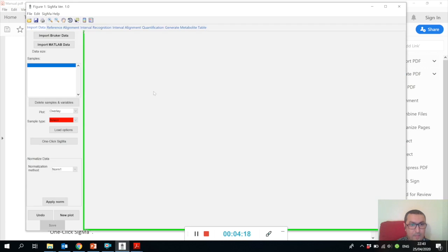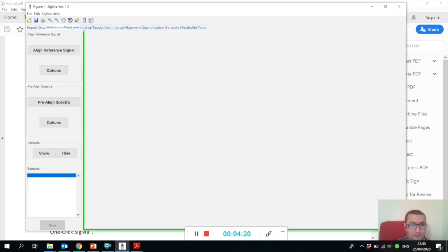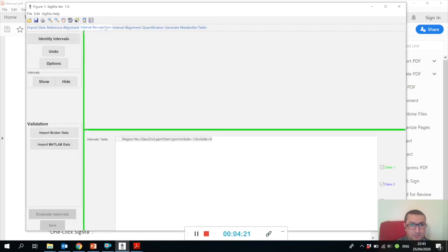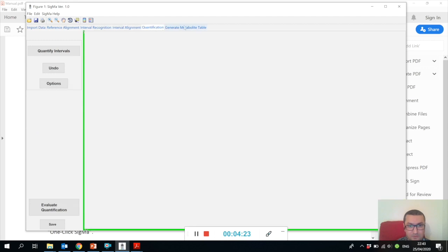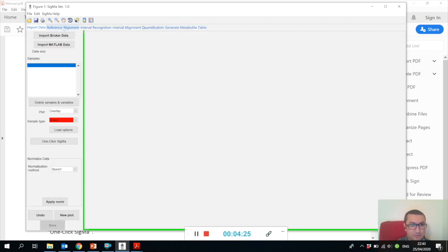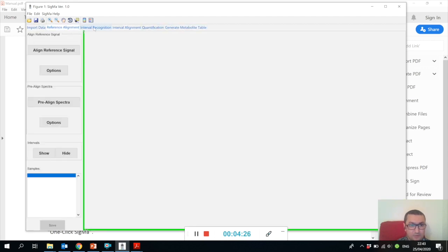Sigma consists of separate panels we call tabs, and in each tab you do some stage of the processing.